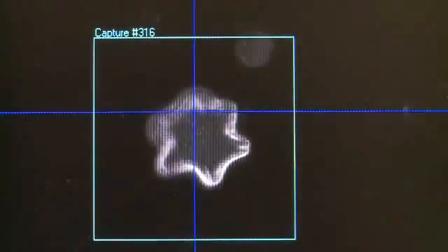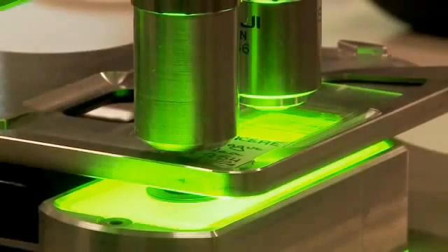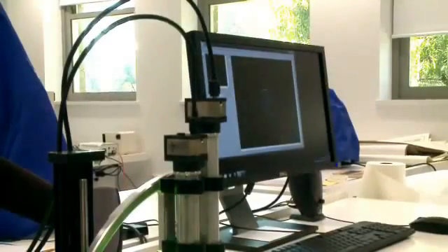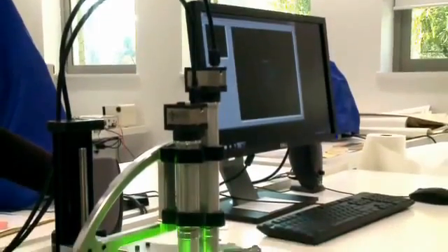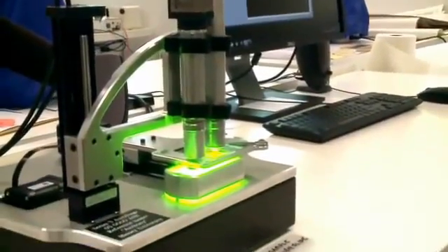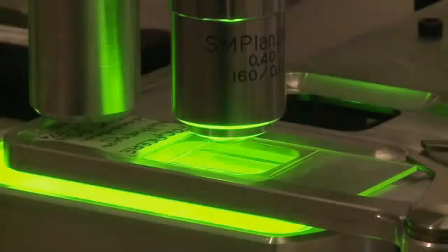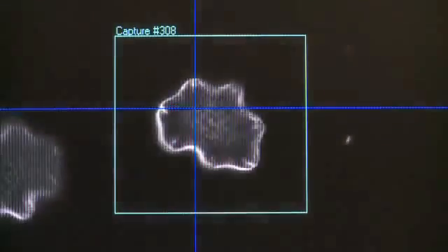The pollen microscope is an instrument developed by Massey University in New Zealand to automatically capture images of pollen grains on slides, make measurements about those images, and classify and identify the type of pollen that each grain belongs to. Essentially what the microscope is doing is trying to find certain shapes and sizes of particles — roughly spherical shape and a certain size range.